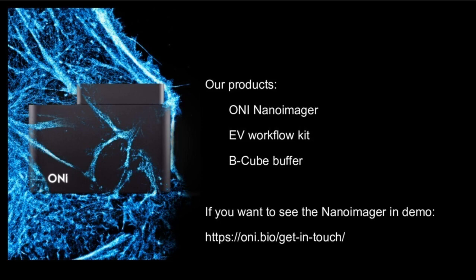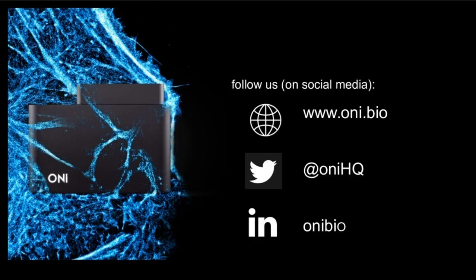Okay, so now it's question time. Before we start answering questions, I will say that there are so many questions, it's impossible to answer them all. We are also running a little bit late. We will make a Q&A summary of all the questions and answer them, and we'll send it around to all the attendees. Okay, I hope you're happy with that.